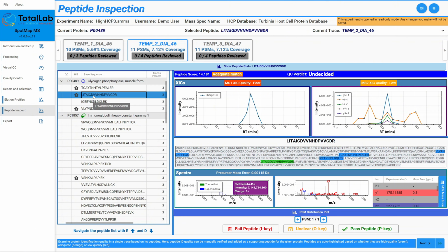The top 3 PSMs give us confidence that this peptide sequence has actually been found, is actually a match. And then the other matches around this, all of these peptide sequences, are again all part of this host cell protein, or we suspect them to be, so we can make that assumption. You can see all of them here. It's quite a high-level concept to talk about. I've probably made a few mistakes there because this is the first time I've talked about it.